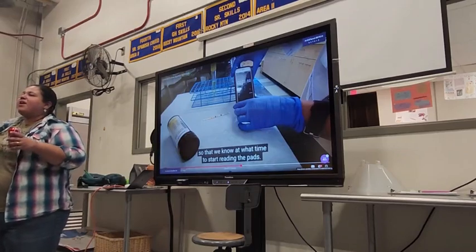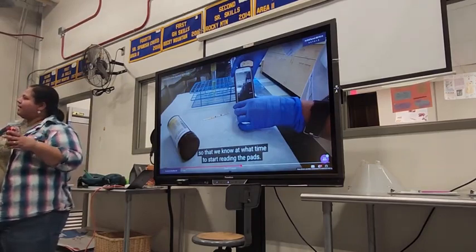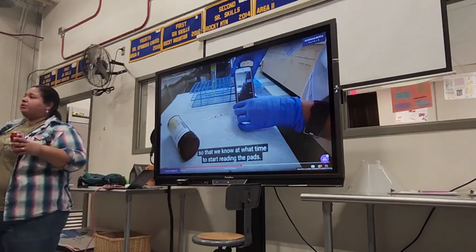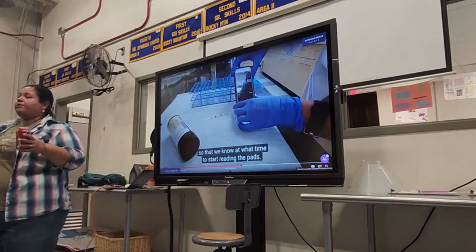That's why we're just going to wear... We're going to be safe. We're going to wear proper PPE. We're going to wear gloves, right? It's going to stink tomorrow too, because we're going to have poop. We're going to have fecal float.